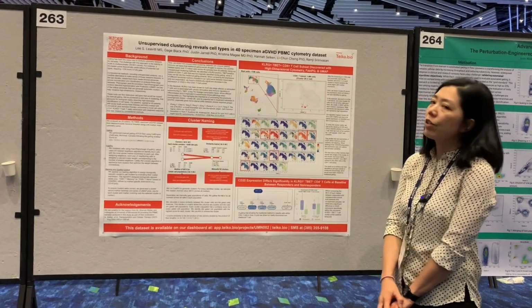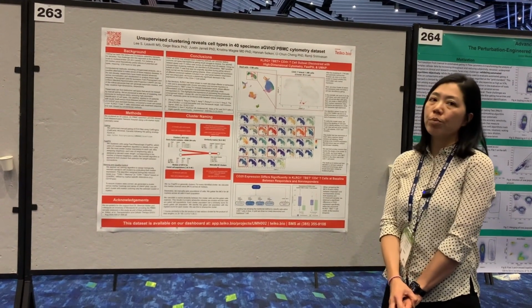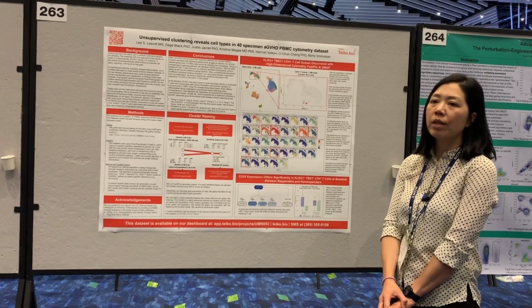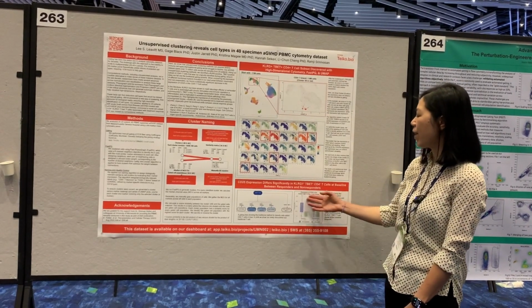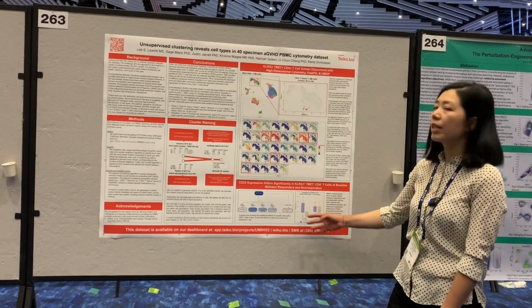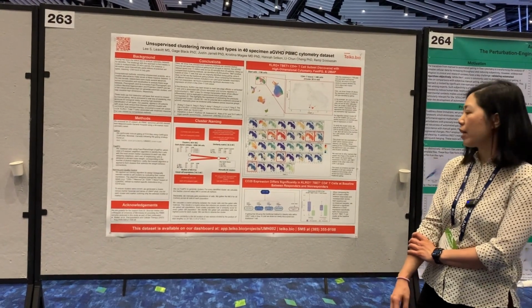We then further looked at how this cluster expresses other functional markers and whether they show significant differences between responder and non-responder, or time points. We found that CD25 expression within this cluster is significantly different at baseline between responder and non-responder.